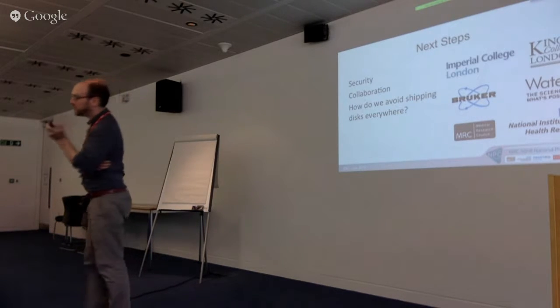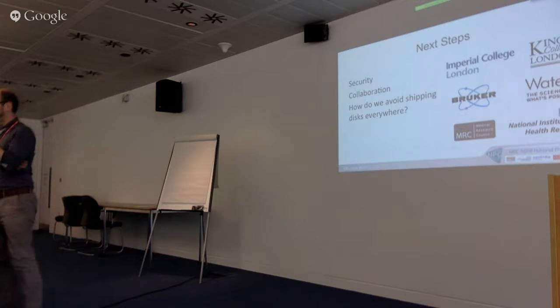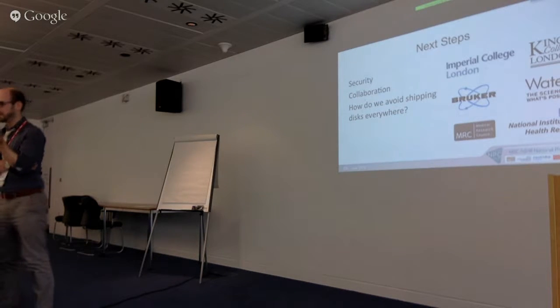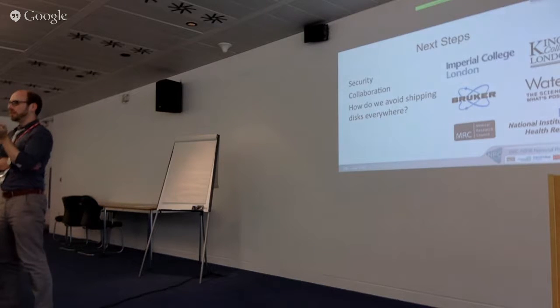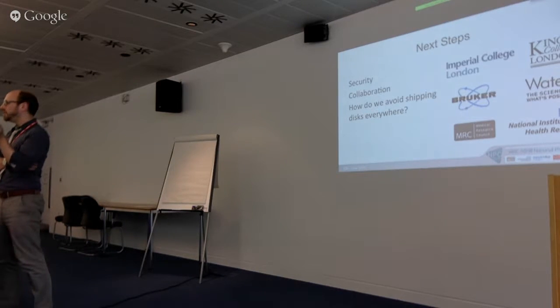That's true, but one thing I would argue, and I think one problem we all face in profiling, is if you're doing untargeted profiling, you have to be able to put a name to what you find. You always have to be able to put a name to what you find, or you're just going to be very disappointed the whole time. If you dig down to the noise level and find something down in the noise, are you convinced that you could then identify that? I think in a lot of cases, without a huge amount of work, you're just going to be sitting there going, sorry, it's too small.